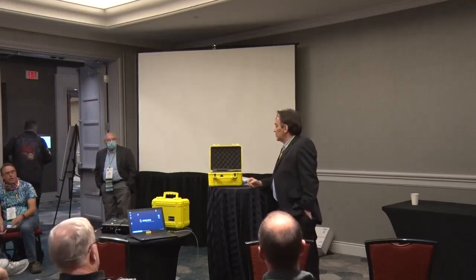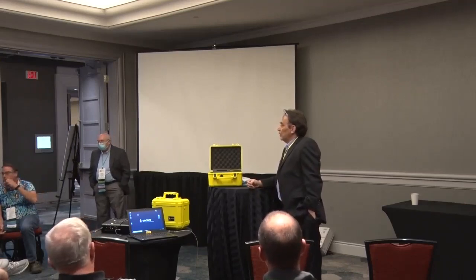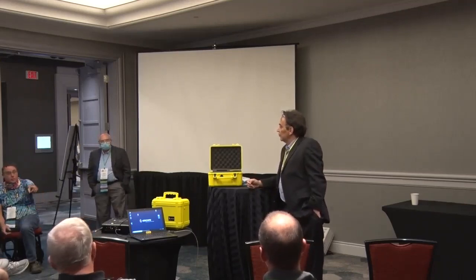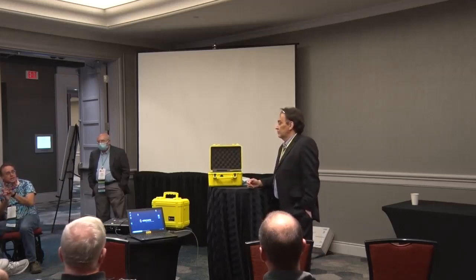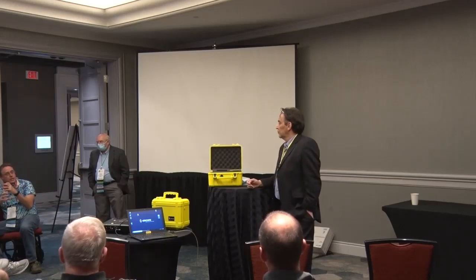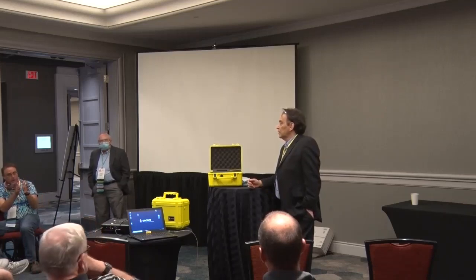Come see me upstairs. I was worried about that. No, it could be that's why I was asking about the filter. Is the desiccant in it saturated and clogged, so I'm not getting the flow? The whole question was related to that.